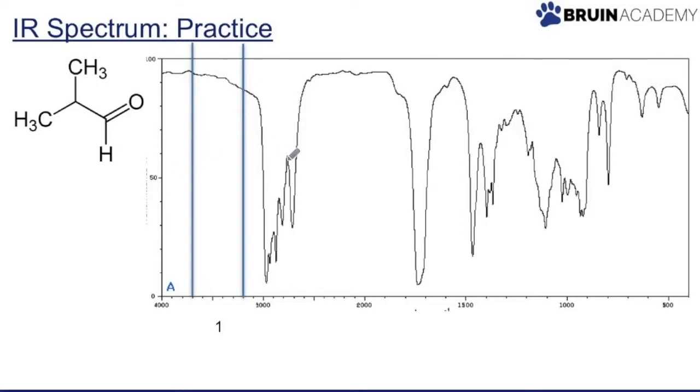So let's take a look at zone 1 here. If you look just within these bars, there's not really anything of value here.